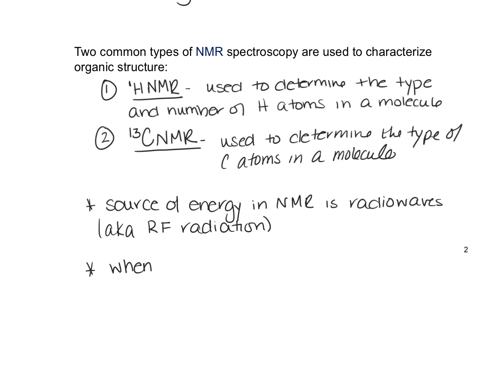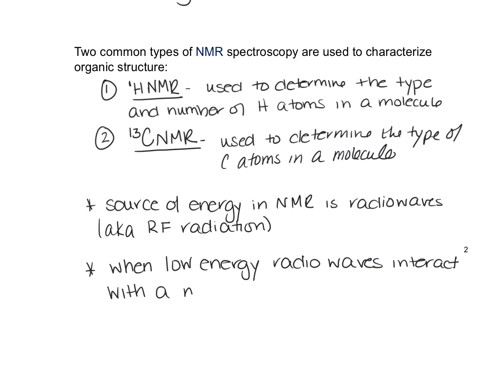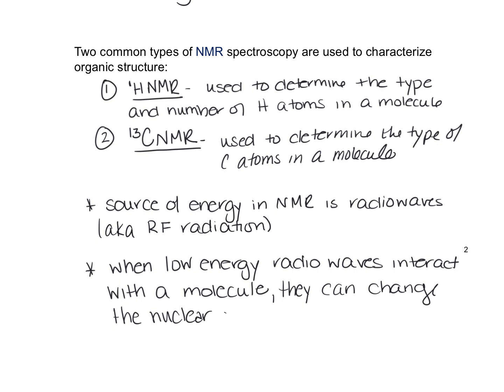So when low energy radio waves interact with a molecule, they can change the nuclear spin of some elements, right? Including the proton and the carbon.